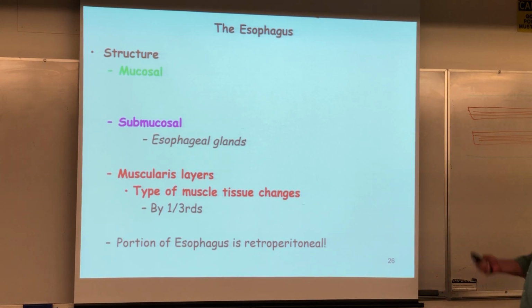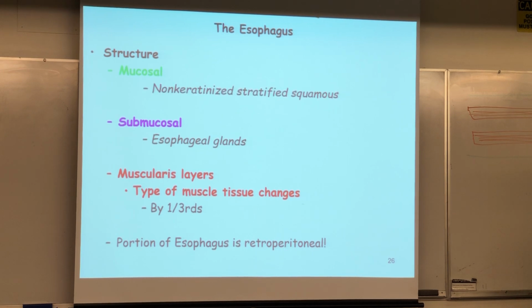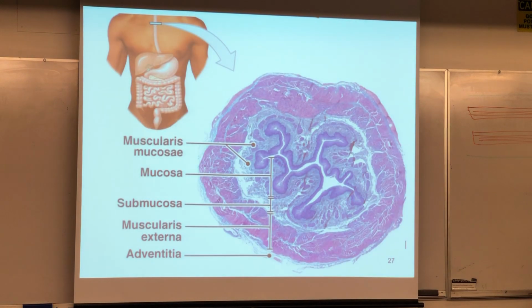All right, so now, in terms of the esophagus, I know it has a mucosal layer. I know it has an epithelial layer. They all do. But instead of the mouth that had keratinized stratified squamous, now we're going to have simply non-keratinized stratified squamous. Remember, you need squamous, you need stratified where we have lots and lots of friction. So like the apple I ate just before we had a little quiz, right? Those are rough surfaces going down my esophagus, you need multiple layers of skin to kind of protect the underlying structures. So it has to be stratified. It just doesn't need to be keratinized. Let's go look at a picture of that, and then we'll come back and finish the other 2 topics.